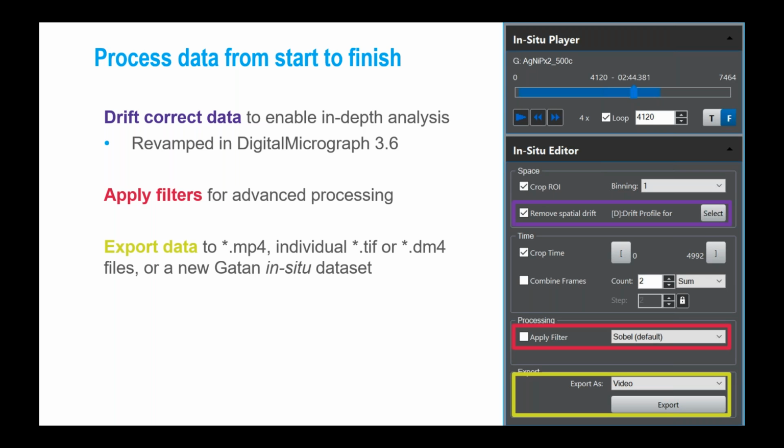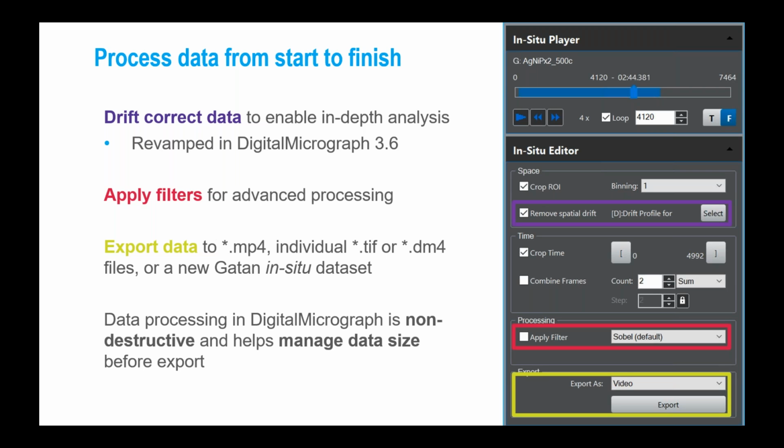And then when you have your video all set up, you can export it to an MP4 video or a Gatan in-situ data set. You can do things like export one frame to a TIFF or a DM4 file, or sum together the whole video into one final image. There's many, many export options.